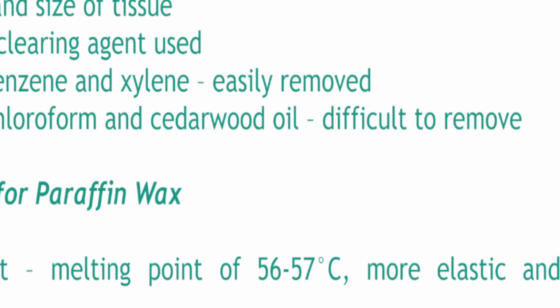Substitutes for paraffin wax, you could use paraplast, which is basically plastic. What's important about this one is that it has a higher melting point, and it is more elastic and more resilient. The reason why not a lot of hospitals use paraplast is because it's expensive. Embedol is also the same thing. It has a higher melting point.